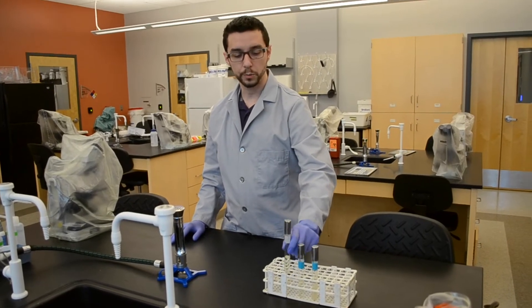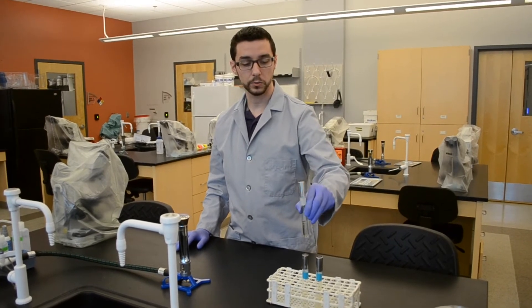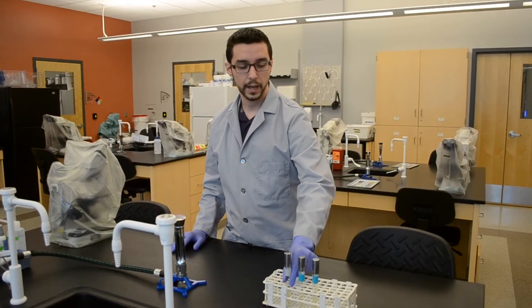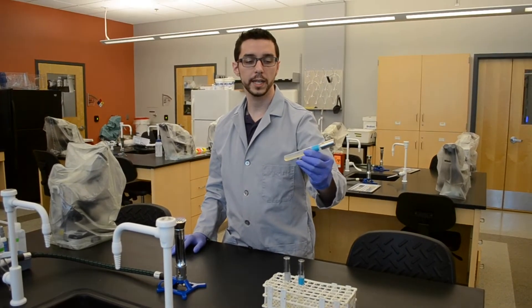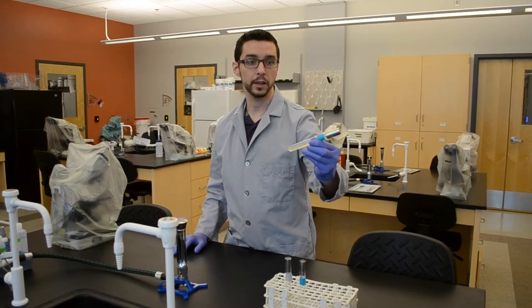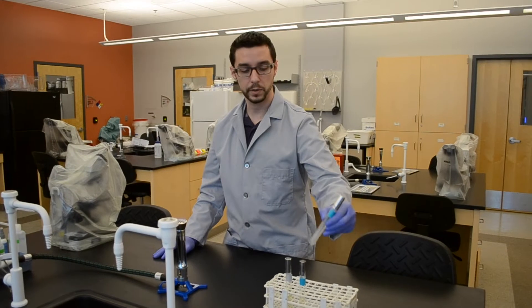With broth tubes, you will find a tube that has liquid inside and the media will vary. With slant tubes, again the media will vary, but it's a semi-solid media that has been poured in and allowed to solidify at an angle. It's no different, typically, than the media that you would likely find in a petri dish.